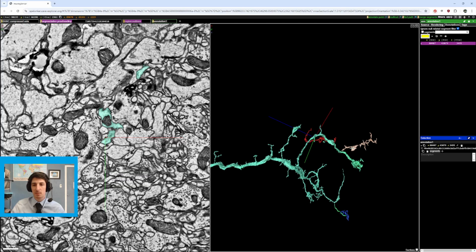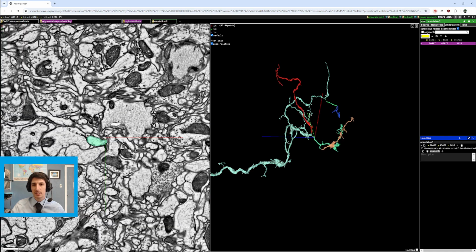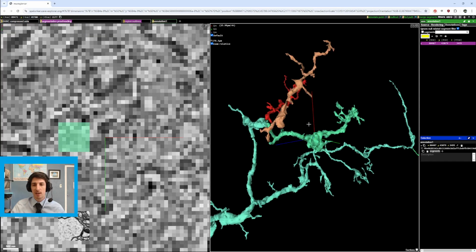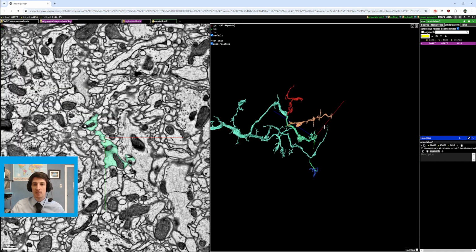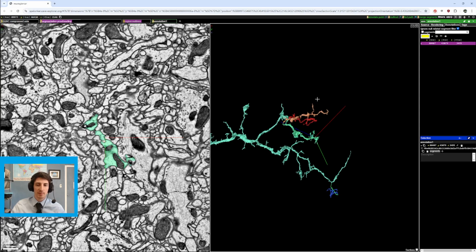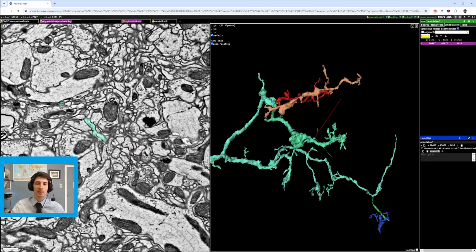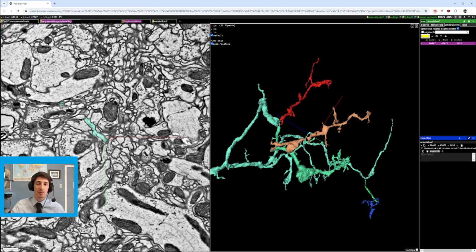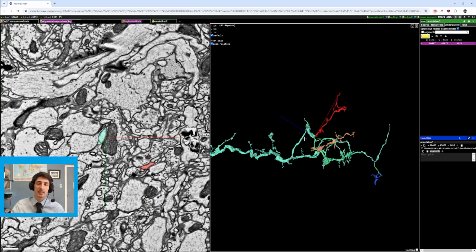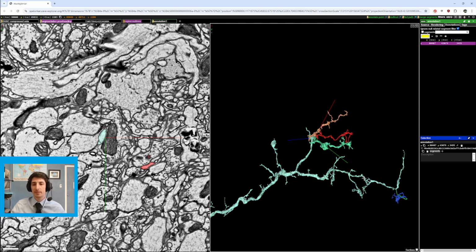This is another medium small branch, so that was one that I checked. But this also did not lead me. This was promising. I thought it was going to be that, to be fair, but it was not. I traced out this. These are all small-ish branches. You would want to add these probably, but if you are going for ultimate speed, these are the types of branches you may skip over, though if you don't know where the soma is, these are branches that you're probably going to run into while you're looking for the soma.